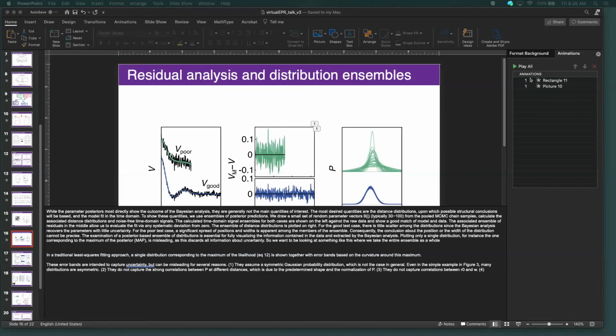So recently we have been working with polymers, and if you look at a distribution of end-to-end distance, by its principle the shape will be non-Gaussian because it's just the way end-to-end distance distributions work. So how do you solve such problems when the distribution is by its nature non-Gaussian?